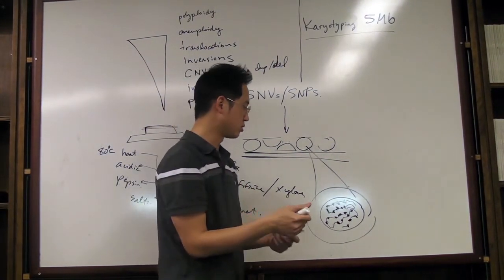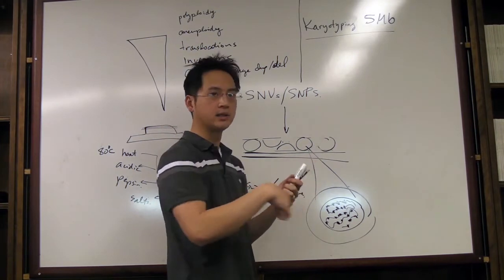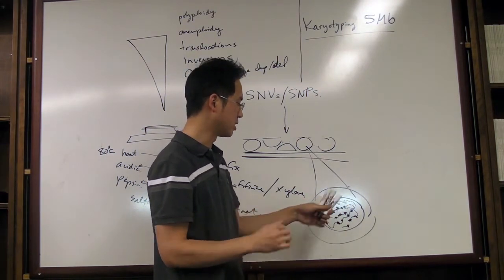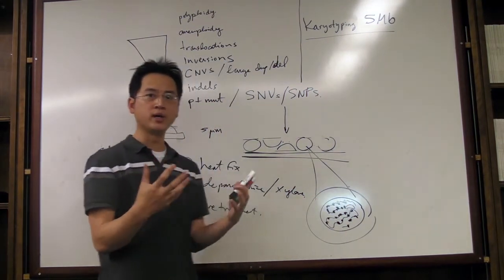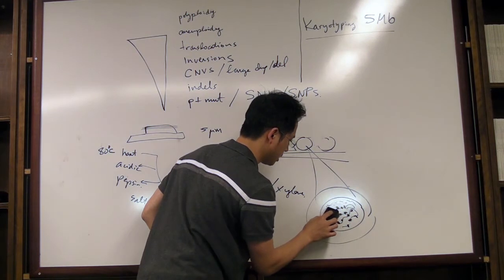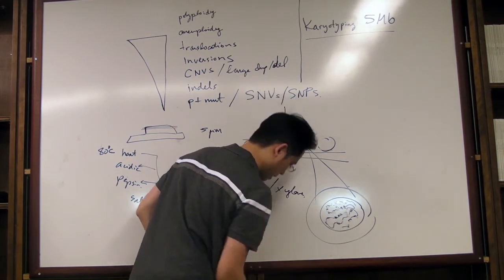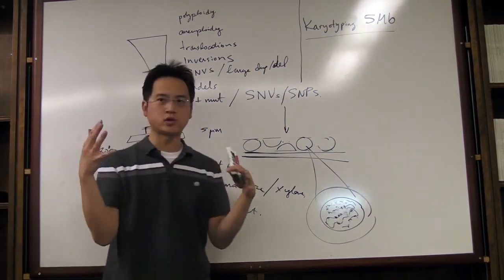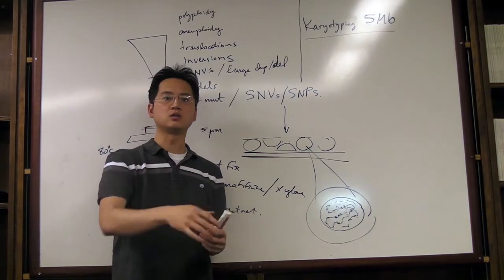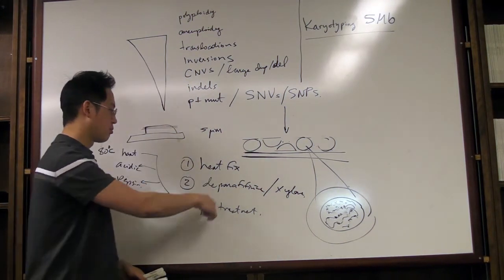The histones and the proteins that are part of the nucleosomes and all of that architecture is used to organize your DNA, your 6 billion or so nucleotides, but you now want to deorganize it. You want to open it up so that it's ready for probing. So that step gets rid of some of this and allows the DNA to relax even a bit more. And it gets rid of some of the tortuous sort of environment in the nucleus, and also in the cytoplasm, so that your probes can make their way into the nucleus and therefore stain the targets that you're looking for. So this is a make or break step right here.